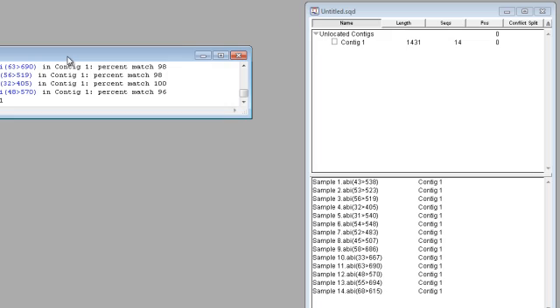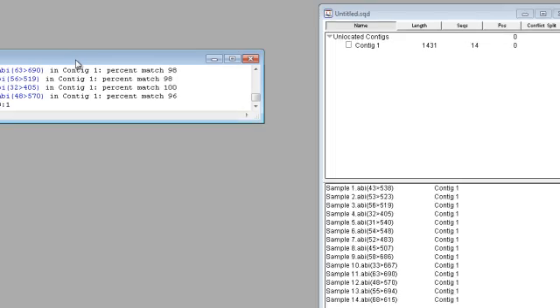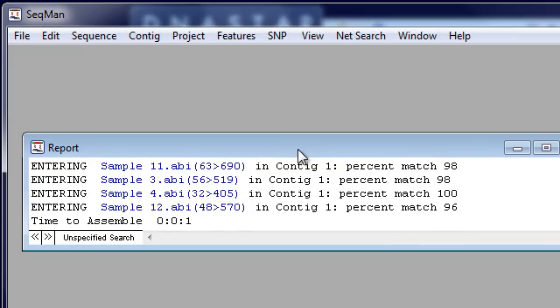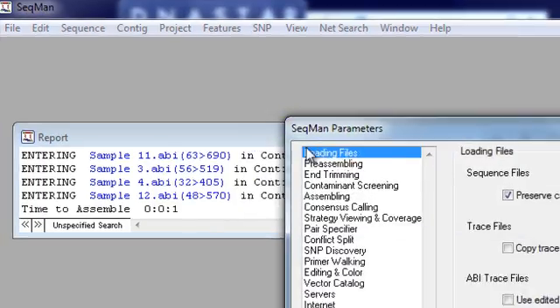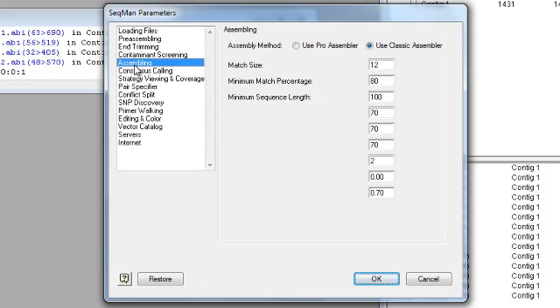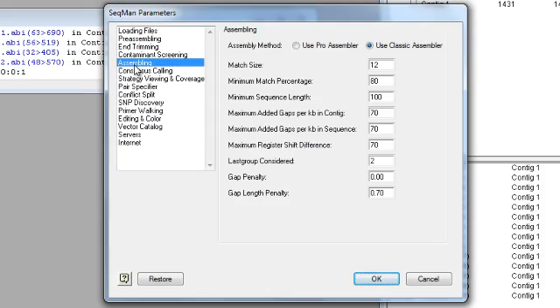In cases where not all sequences are assembled, you may want to go to Project, Parameters, and adjust the assembling options to be less stringent.